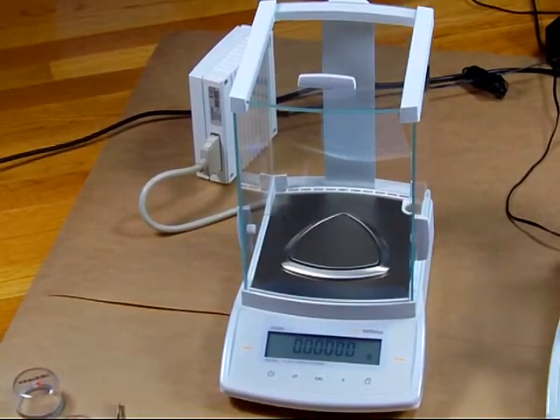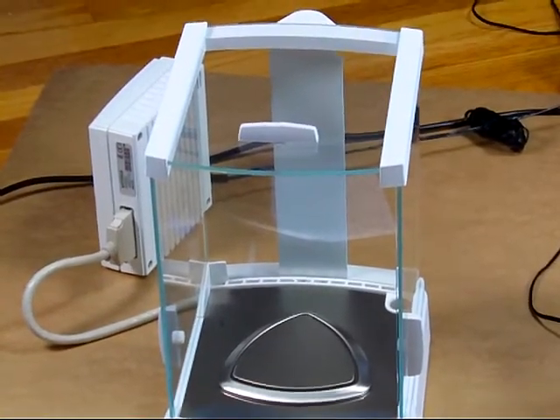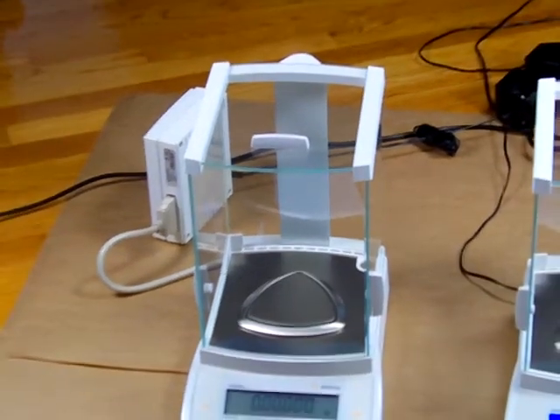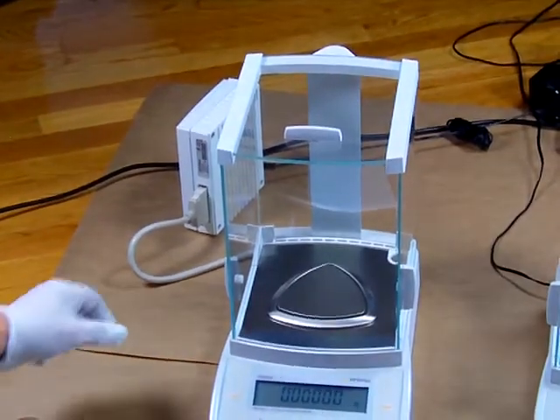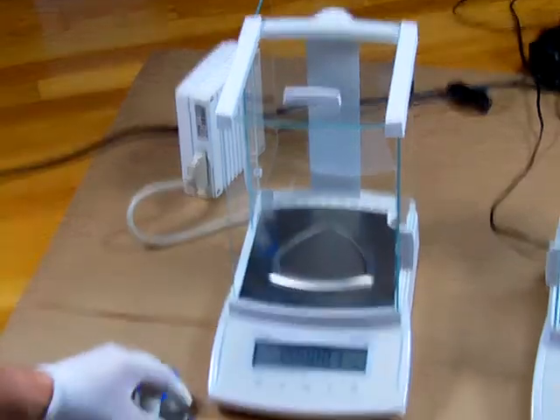We'd like to show you some performance on this Sartorius CPA225D Semi-Micro Balance. Sartorius offers the latest weigh-in technology with their monolithic cell. No one else in the world has this — it's a single block of aluminum offering spectacular performance.